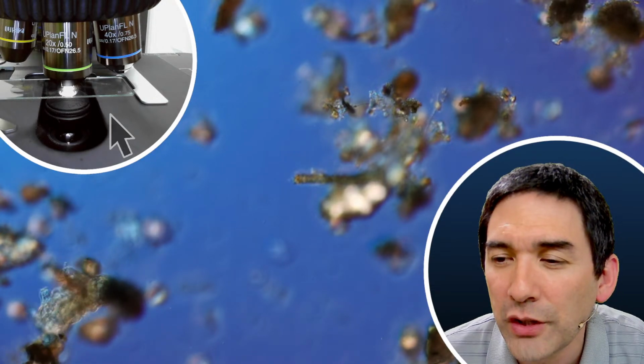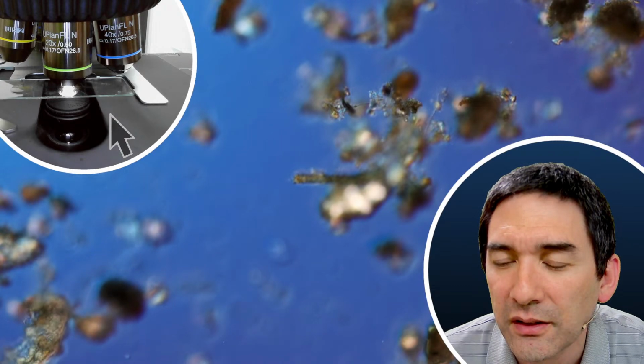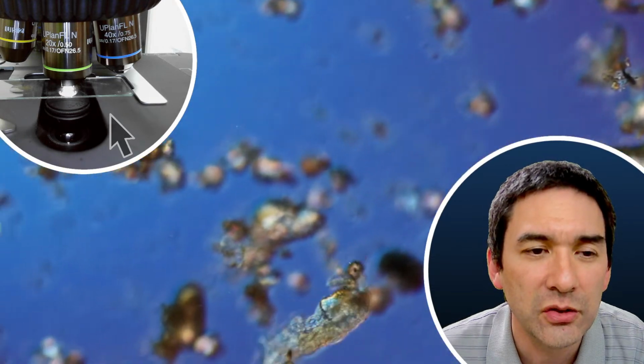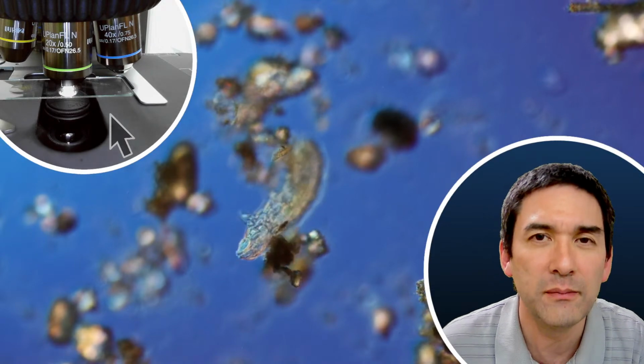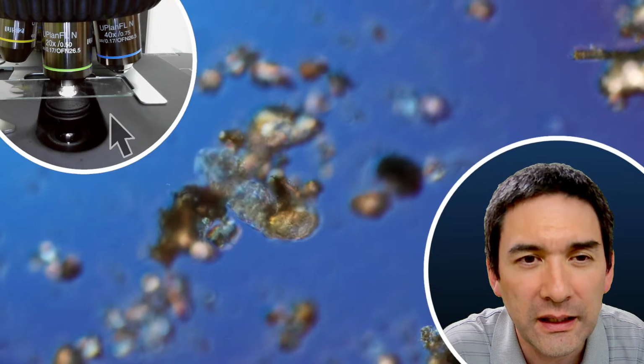You may have already checked it, but on the top of the condenser lens below the slide is where I usually get dust trapped. So what I suggest is that you indeed ask yourself all the time, is it really worth cleaning?